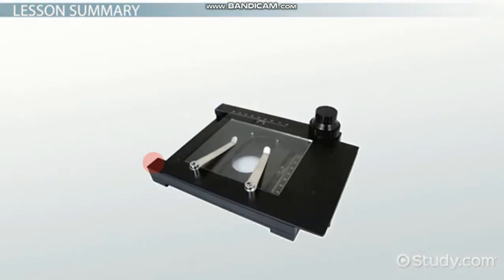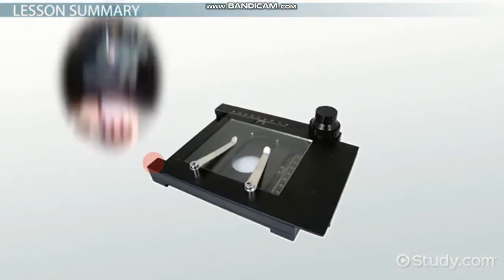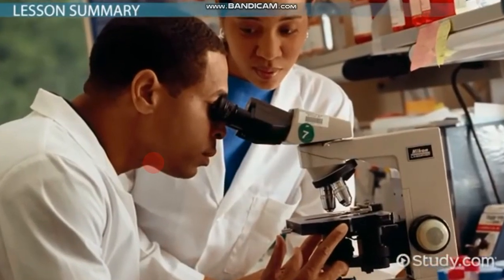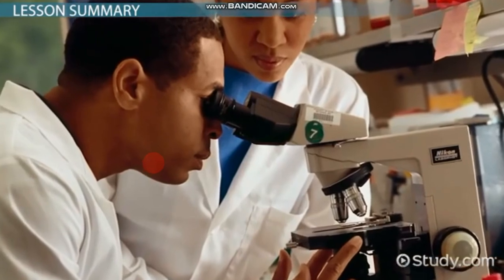The basic parts of a microscope include a stage to hold the sample, a light source and a way to focus the light, and a series of lenses. The best part about microscopes is that just about anyone can learn how to use one.